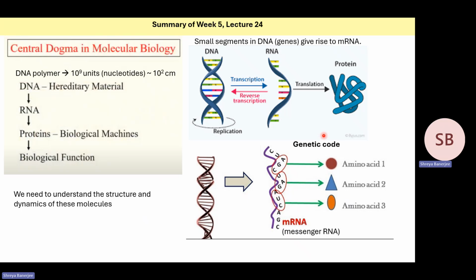So now we have looked into many different kinds of NMR. But the purpose of this series of lectures is to look at the applications of NMR in structural biology. So far we have only looked at NMR. Now we look at some elements of structural biology so we can understand what we are supposed to study using this NMR. So we'll just talk about some points of structural biology in short. Just give me 2 minutes.